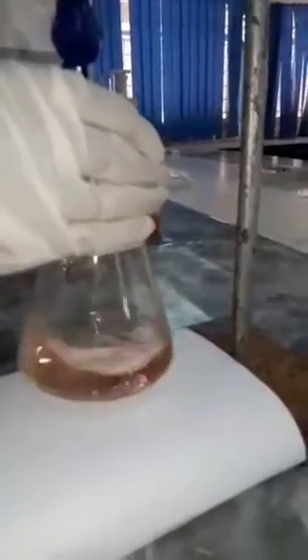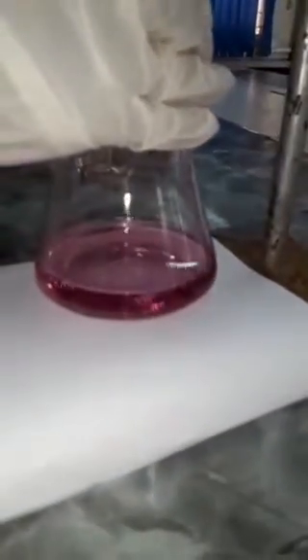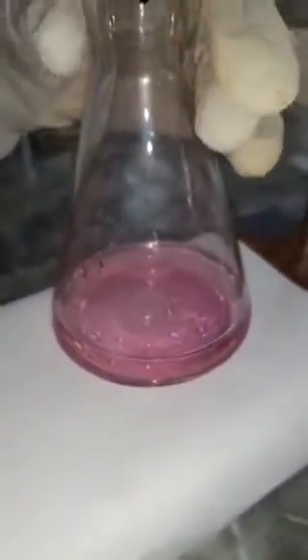So our end point would be the first change in color. So the color we're expecting is the color for the potassium permanganate. Of course, it shouldn't be very dark. If it becomes dark, that's overshooting. It should be very pale, but it should be a purple color. A pale purple color, which is pink. So that's our end point. So that's the color, the pale purple or pale pink.